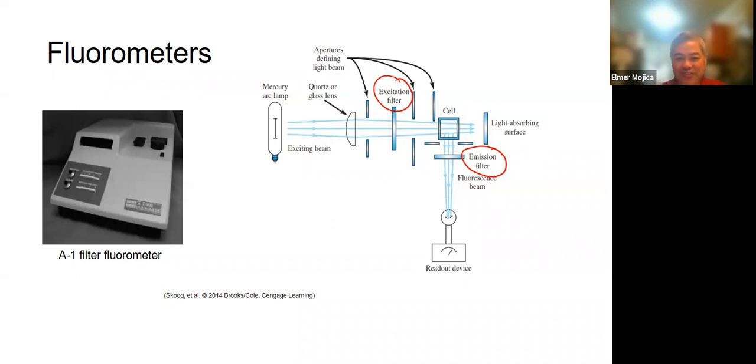Okay, because if you're going to look at the direction of the light, kita nyo to, it hits the sample there, and then we monitor. It's either an L shape or a T shape. Pwede ka rin magkaroon ng dalawang emission detector. It's also possible, like a T-shaped thing.